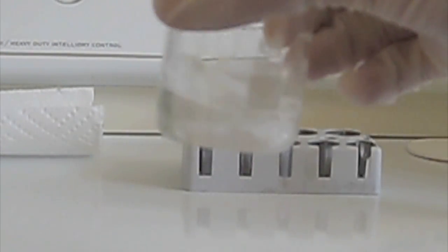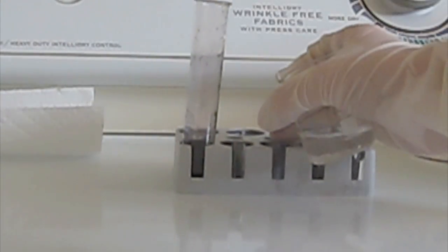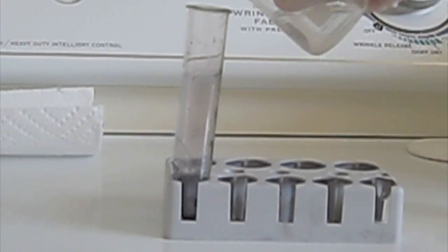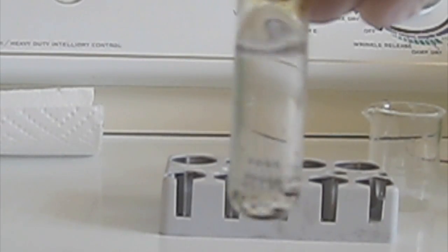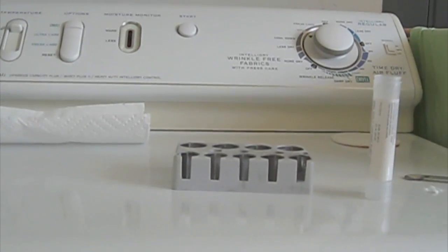This is a sodium thiosulfate solution. Add the sodium thiosulfate solution to your iodine and watch what happens. The solution will be clear instead of browny yellow as if you were to add water to the iodine. You can see it's clear. This is because the iodine is reacting with the sodium thiosulfate to produce iodide ions in the form of sodium iodide. This can be flushed down the drain.